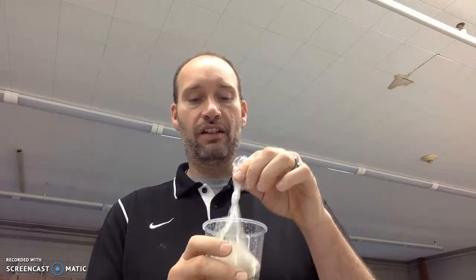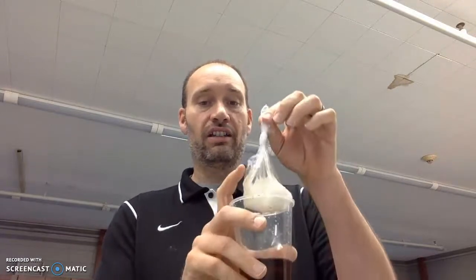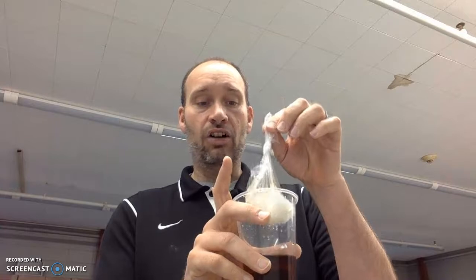Now, what I want you to think of, when you're looking at the lab, is what is going to happen. If we're saying the bag is representing a cell, and this is our selectively or semi-permeable membrane, now, if the cornstarch is able to diffuse out of the bag and into the iodine, what'll happen? Or will it be the other way around, and the iodine will go into the bag? How would we know? That's where the indicator comes in.